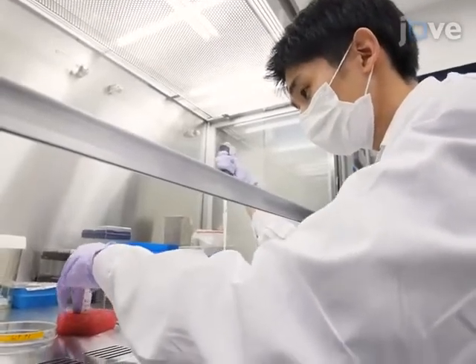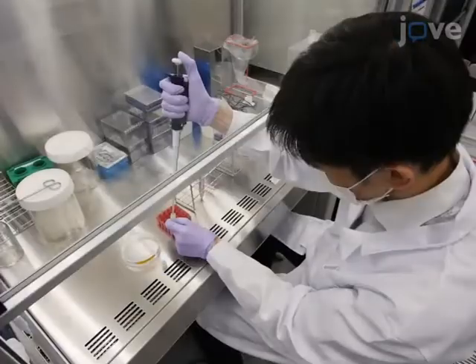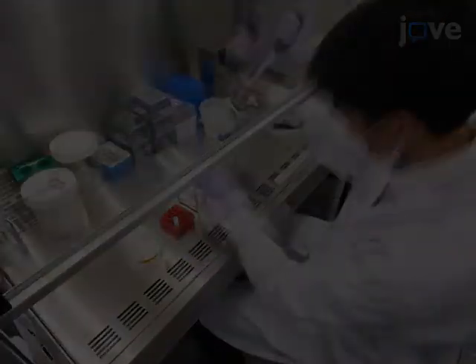2 to 3 days before seeding the microfluidic device, add 3 times 10 to the 5th freshly thawed cells.